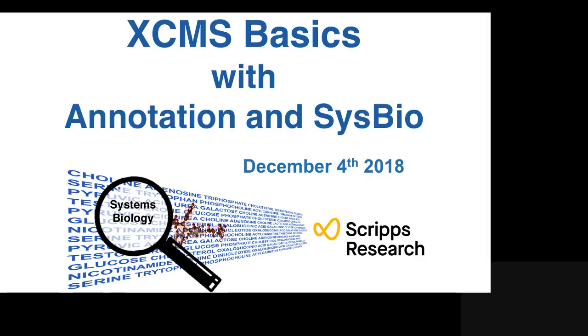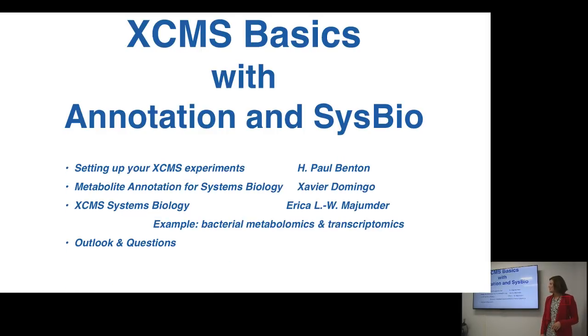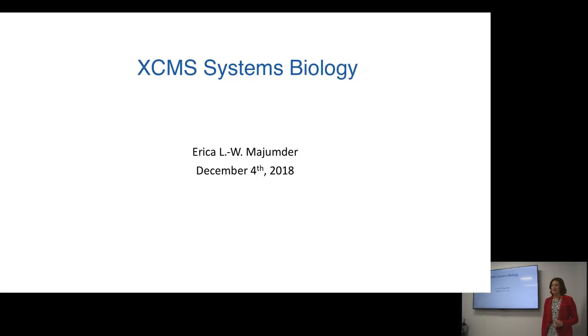So I'm Erica Majumder. As they said, I'm the newest postdoc here at the Scripps Center for Mass Spec and Metabolomics. And I'm excited to share with you stories about using our systems biology platform.